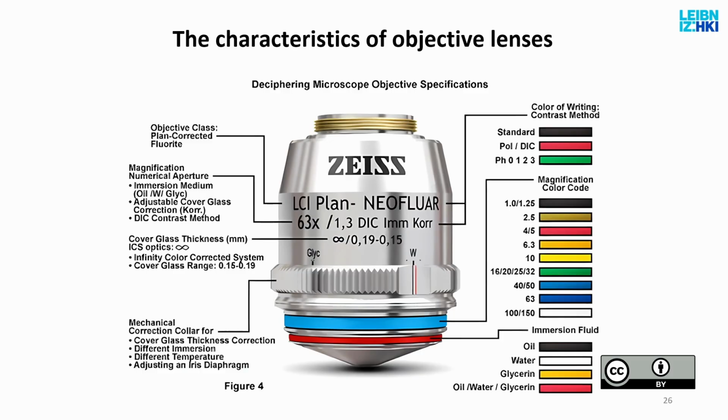It will also contain information about the magnification. You remember this is the ratio between the image distance and the object distance. It will indicate, for example, that the lens is corrected for spherical aberration. So at least you can see it well if you get this one.